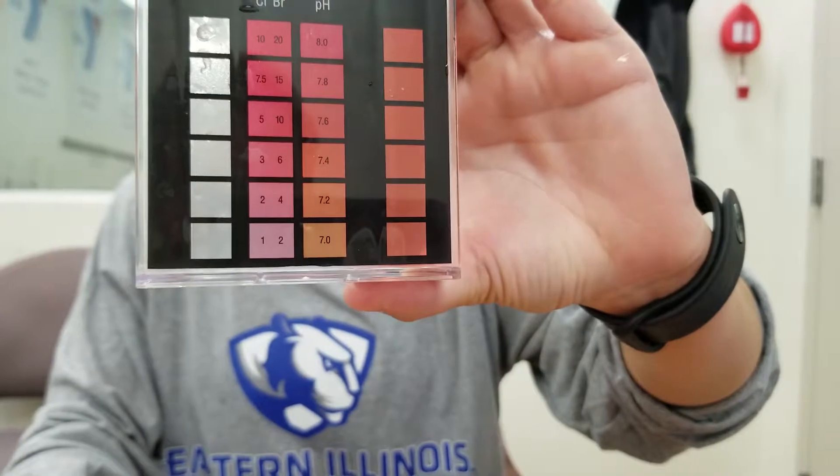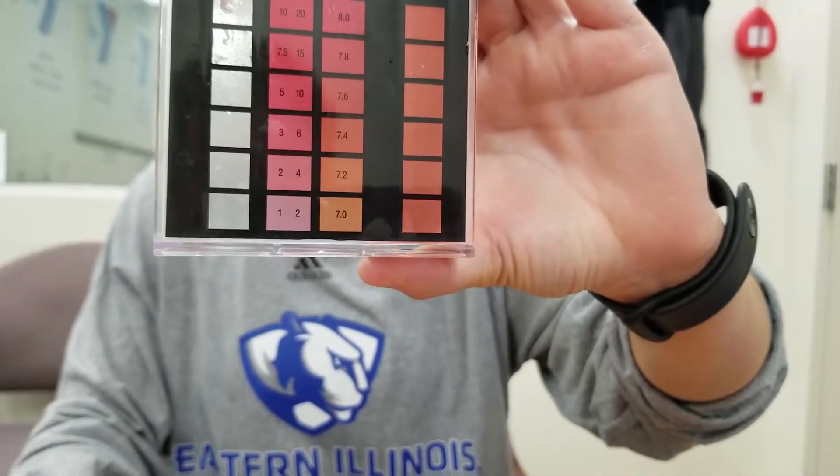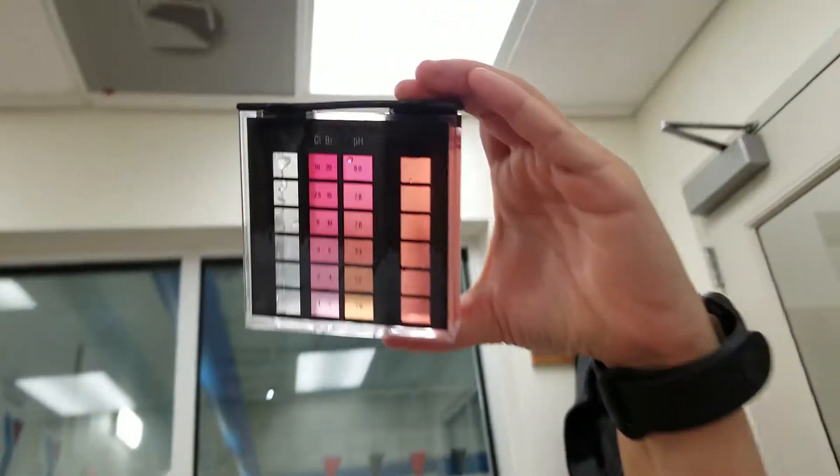Now we're capping it, inverting it, and we're going to get a color match. Sometimes the best way to read this is to put it up against a light or white surface to get a good reading.